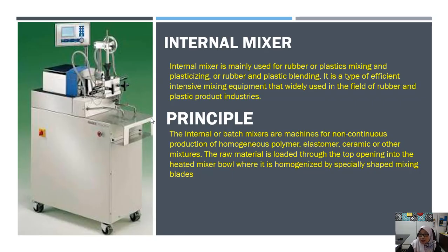This figure shows the internal mixer. We have two of this equipment in our lab. The internal mixer is basically used to mix material, for example rubber or plastic. The technique of the internal mixer is a batch technique.